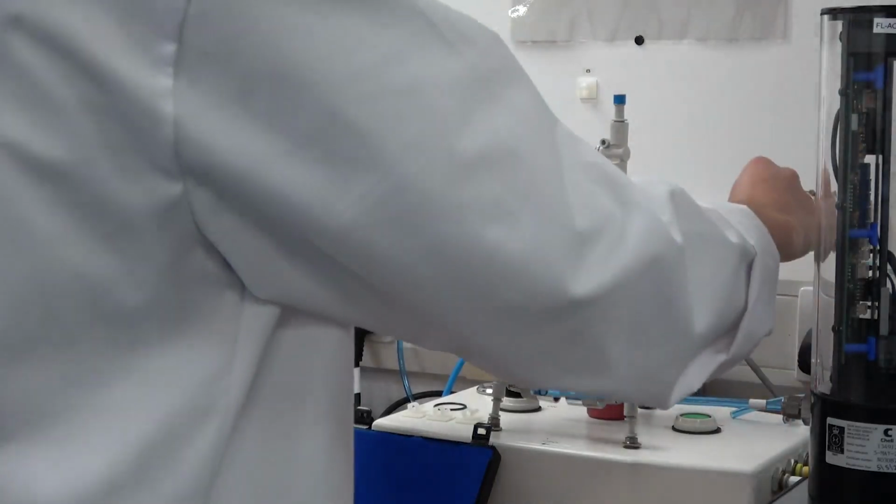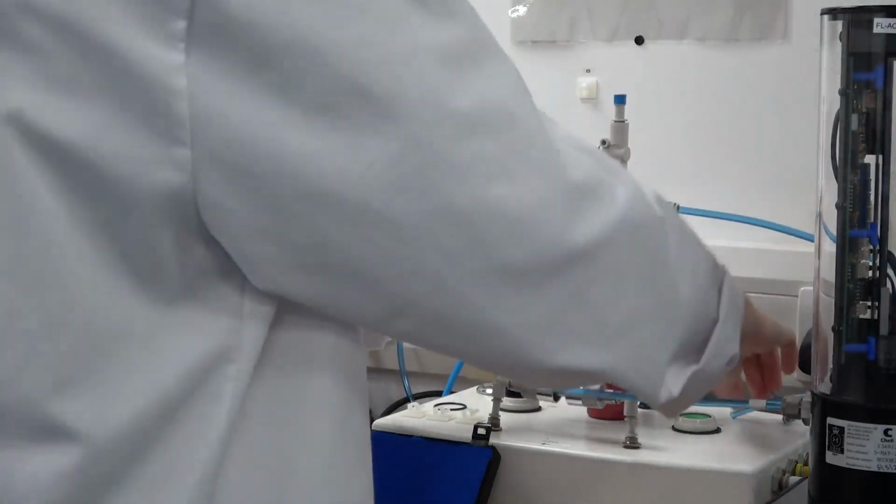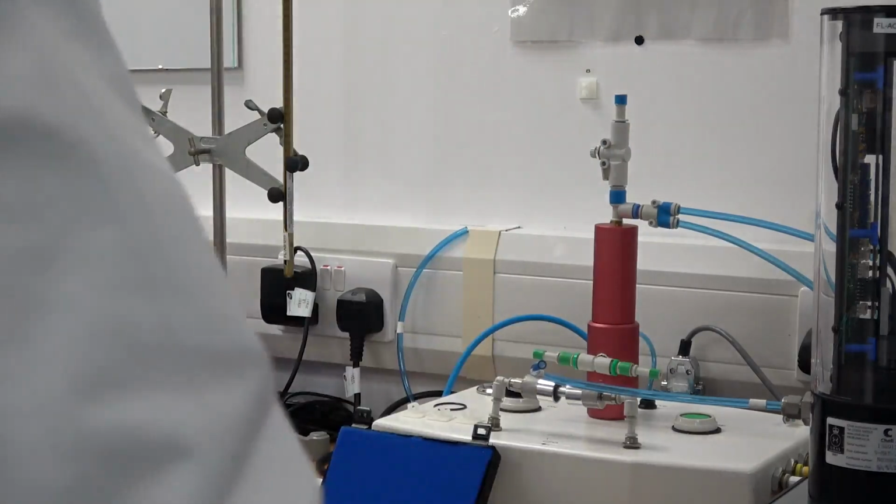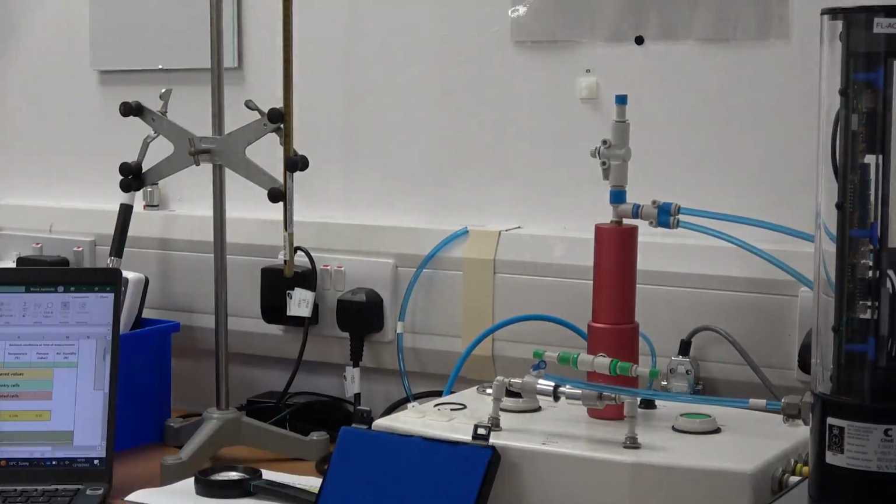Pressure drop is the difference in pressure across a sample under a steady flow of 17.5 milliliters per second, measured at the exit of the sample. PD is mostly defined in millimeter water gauge and in pascals. Pressure drop standards are calibrated using a differential pressure calibrator.